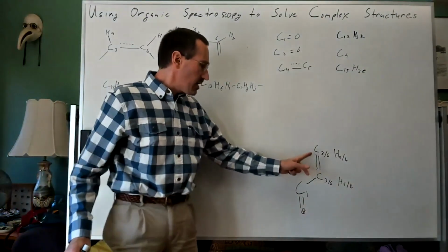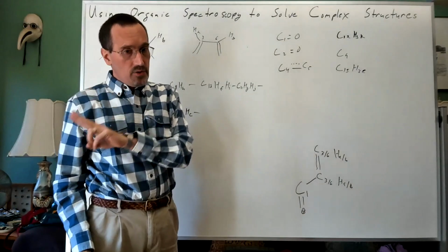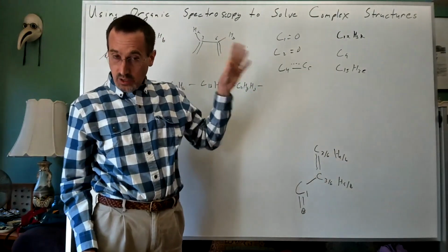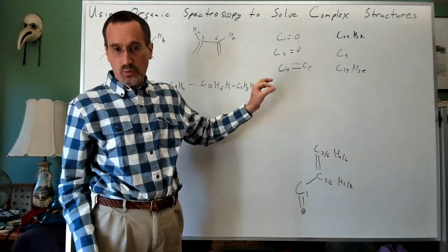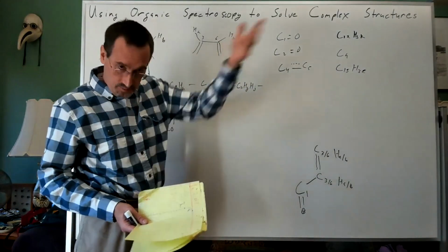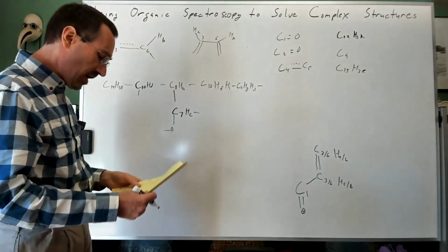And later on, in one of the other problems, you're going to have the same thing with the methyl group connected, and you're going to get cross peaks with an isolated methyl and two quats, carbon 6 and carbon 2. And you know the methyl group has to be directly attached to one of those quats and not directly attached to the other, but one over from the other. So just call each of those quats 2/6 and move on.